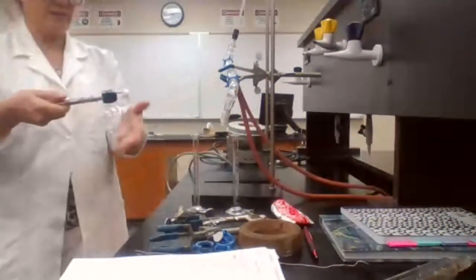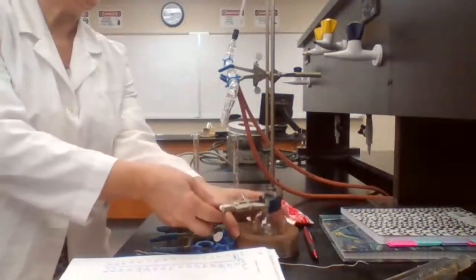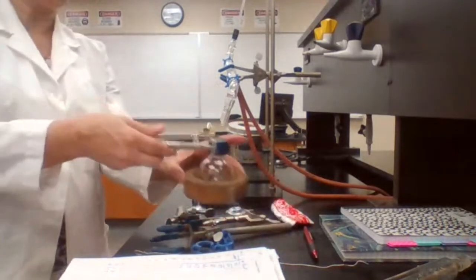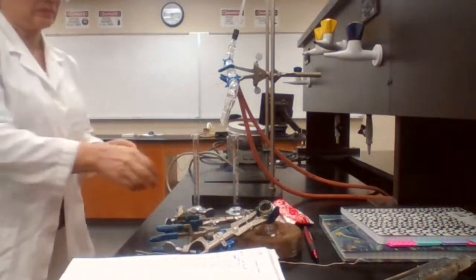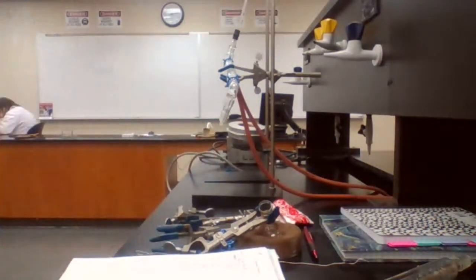When we separate it, we keep it inside a donut again until we are done with the experiment and ready for cleanup. So we are done with this part of the experiment.